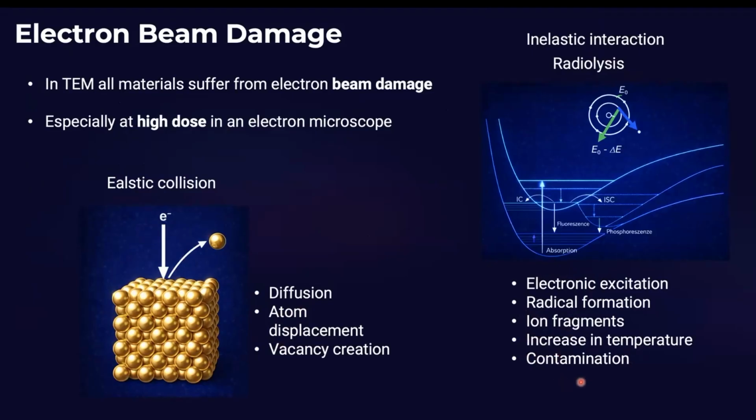In biological samples, it's even more challenging because they are naturally in an aqueous environment. The specimen must be dried before it can be introduced for imaging. It has to be organic, and unfortunately, there are no heavy elements in biological samples such as virus particles and proteins. Ionization and burning is a common problem.